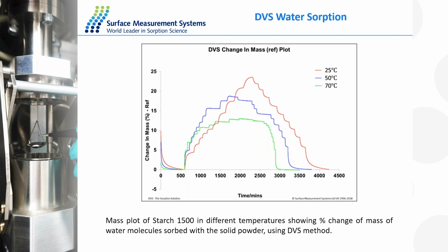I see. Yeah, we have a Resolution. So you're requiring the whole incubator to increase in temperature, and the water bottle too. That's right. That wouldn't really be possible, because that affects the temperature and the stability of the balance. Yeah, I see. Okay.